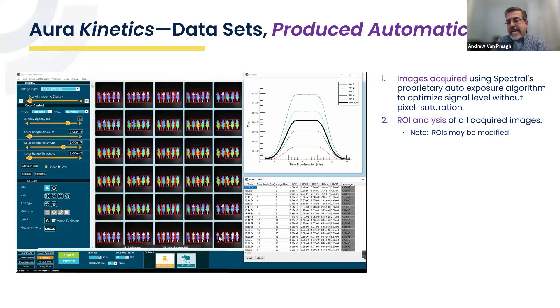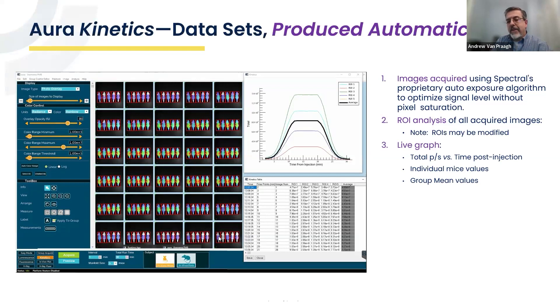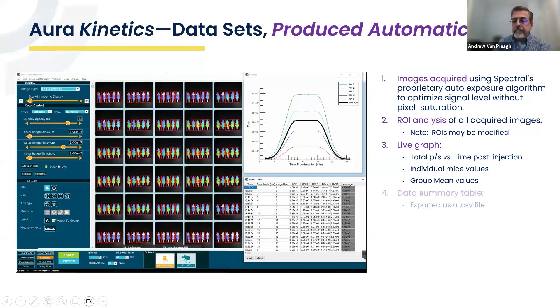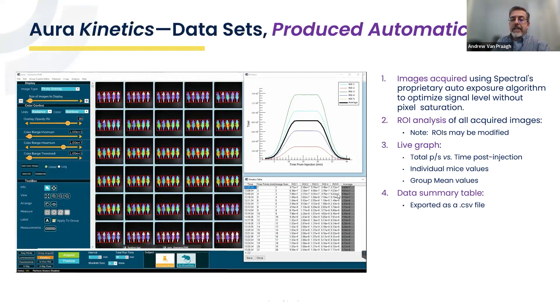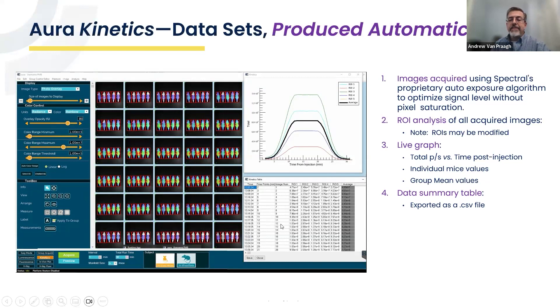As you're acquiring data, there will be a live graph generated from the ROI analysis of the images acquired to date — a plot of total photons per second from the ROI analysis versus time post-injection. You will get not only individual mouse data but an overall group mean or average data on a per-time-point basis. At the end of the kinetic acquisition, you will be given a data summary of all the ROI data generated. You can go to a time point at which plateau occurred — say, 12 minutes — and identify the output of the average or individual mouse data at that time point for your reporting.